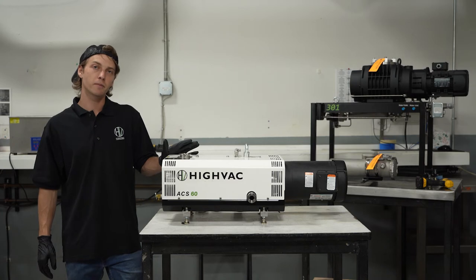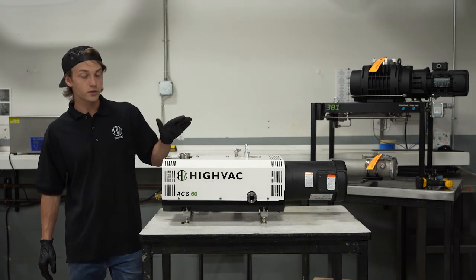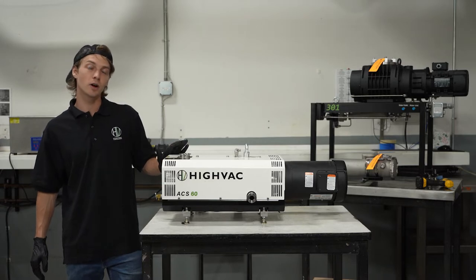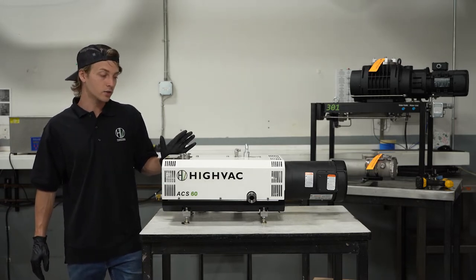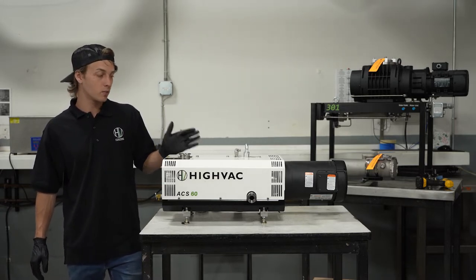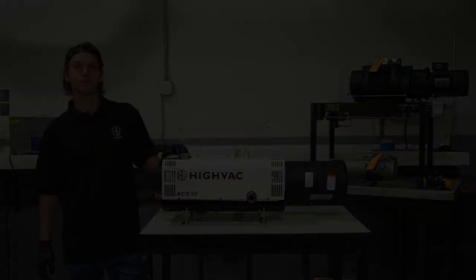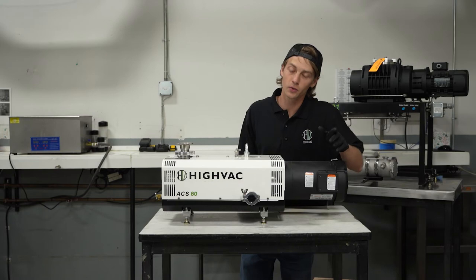Here we have a customer pump that came back to us, seized from process. The way that happens is they shut down their pump without cleaning it properly. What we're going to show you here is the proper way to unstick the pump without damaging it.